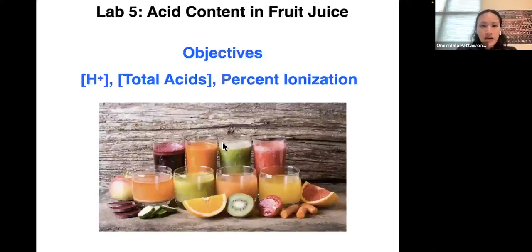Hi everyone, in this video, I'm going to go over the brief theory of the lab for the acid content in fruit juice. I'm also going to talk about the pre-lab questions, and then we're going to end with the procedure in part A.